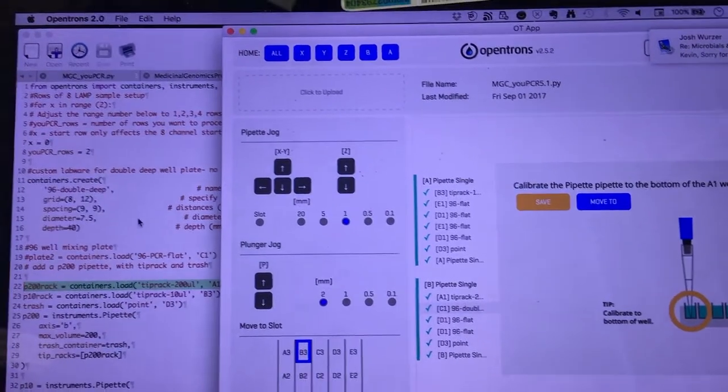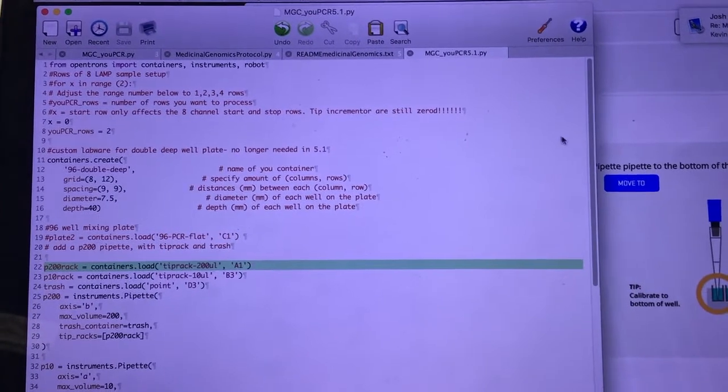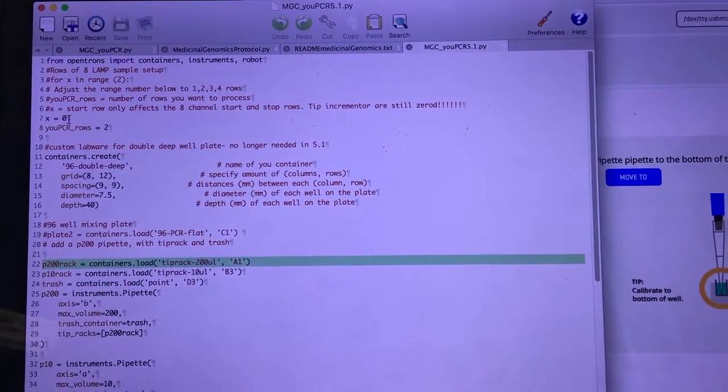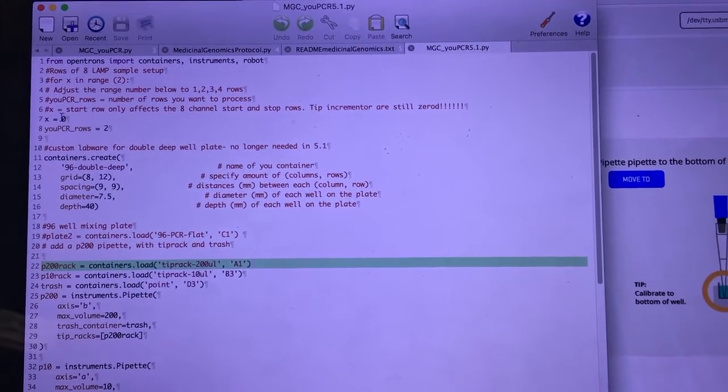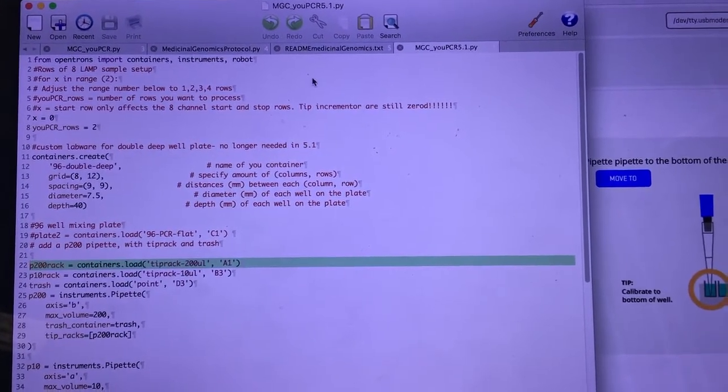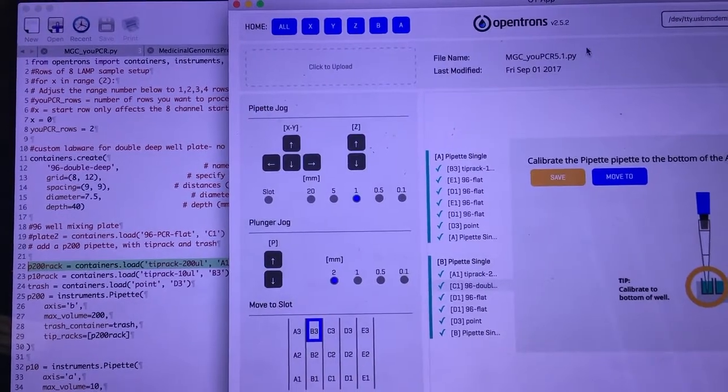It's all run on Python — a little crude on the Python. There's not a lot of GUI that you can use to input how much you want to do, but these two variables right here are the starting row in the plate and how many rows you want to do, and that gets uploaded to this interface to run.